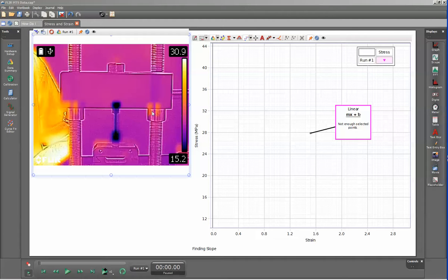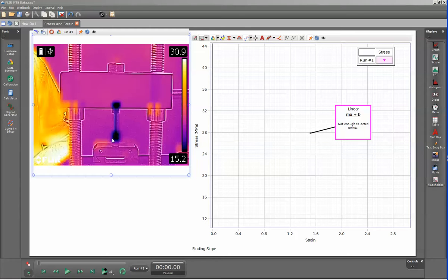I've previously set up the materials testing system with a polyethylene sample that I previously put into ice water to decrease its temperature. You can see in this frame that the sample itself is the lowest temperature of anything in the frame.